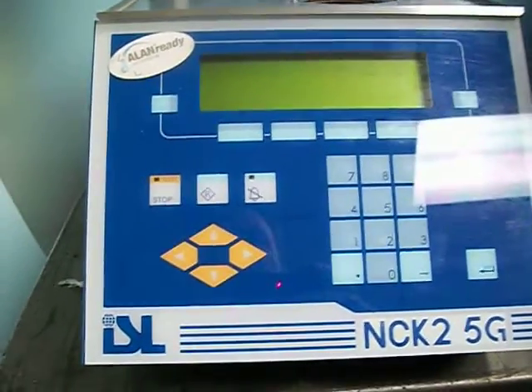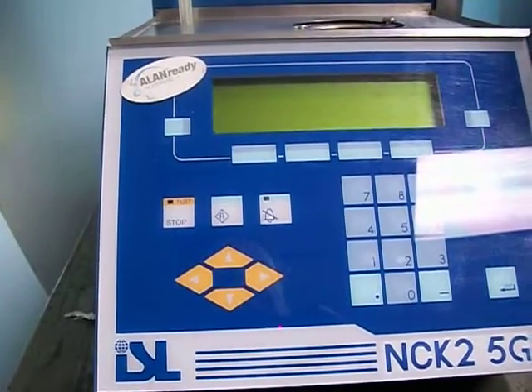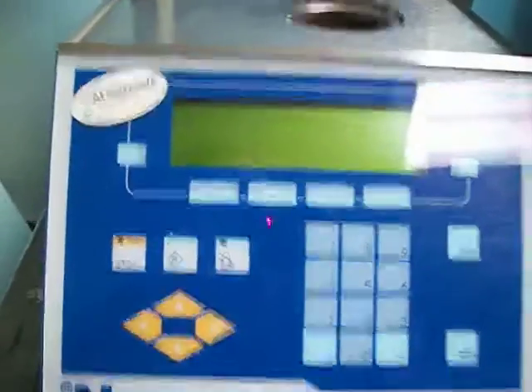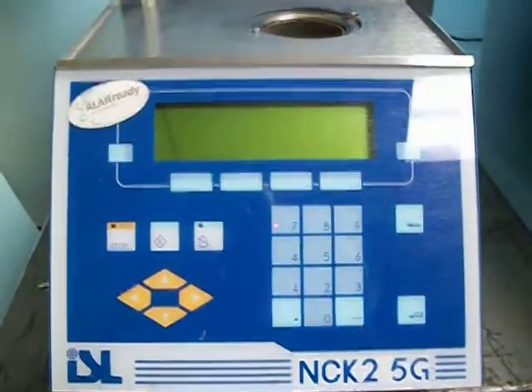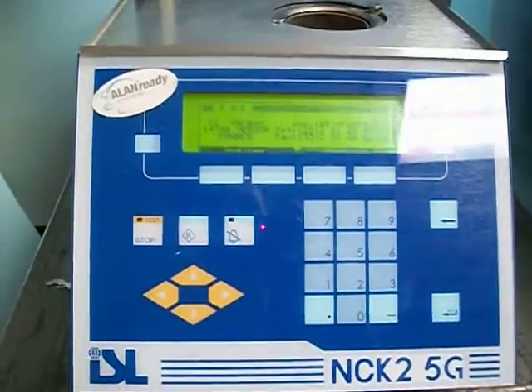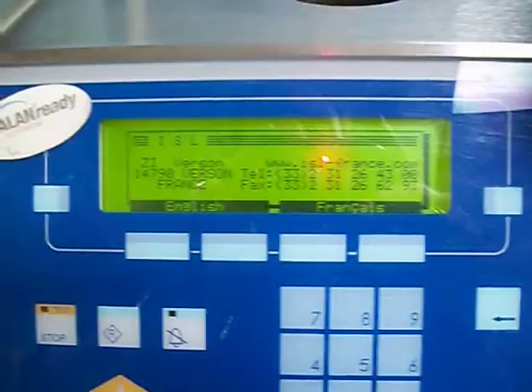This is a demonstration of an ISL NowPAC NCK25G NOAC instrument. I just changed the lithium battery in it, so it's got a new battery. This is just to demonstrate that it is working.